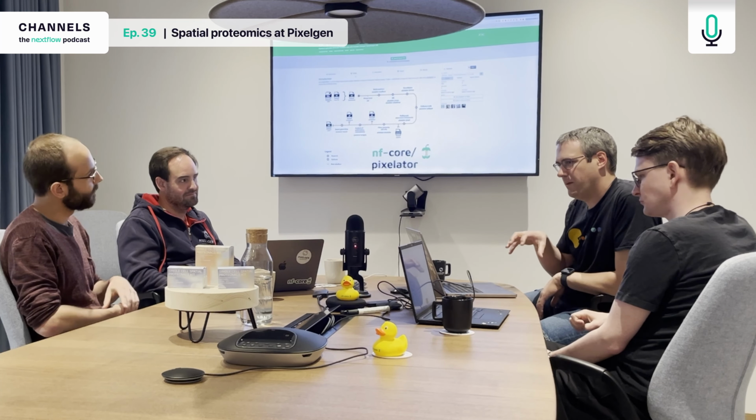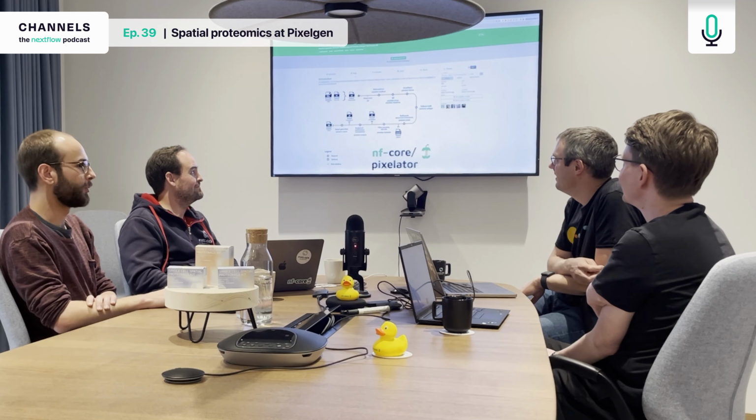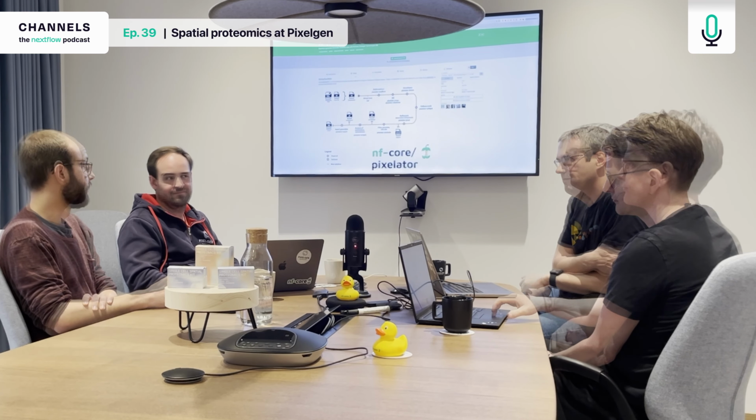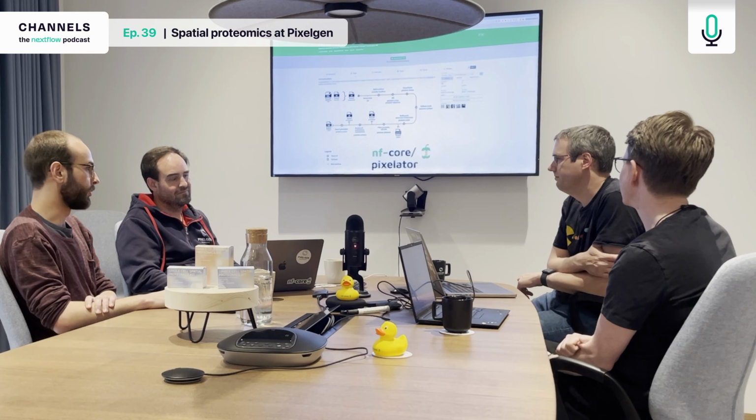But is there anything in the pipeline which you found on a technical level to be a bit different or interesting in terms of writing the code for the Nextflow pipeline? The Nextflow pipeline, you can see it from this metro map, is very straightforward. You just cycle through the stages, and at the end you collect inputs from all the different stages, generate a report, and that's it. This was purposely done. We wanted to keep the pipeline very simple. Most of the logic remains in the Pixelator tool, and the pipeline itself is basically to orchestrate in compute environments and run stuff in parallel.